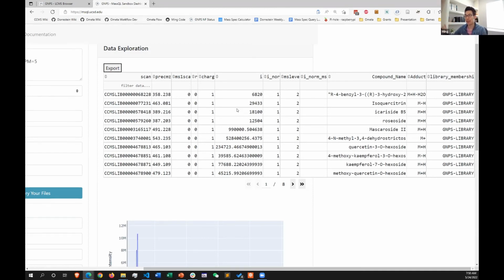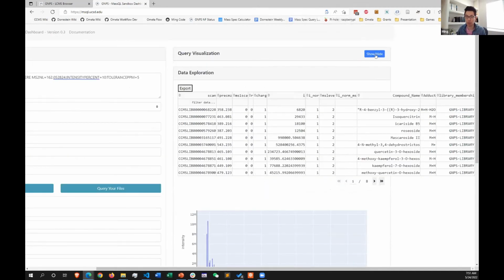So if you have a friend that likes OpenMS and they develop a query there, they can give it to you and you can run it in GNPS. So it's becoming an international interchange of information that allows you to communicate a mass spectrometry pattern.